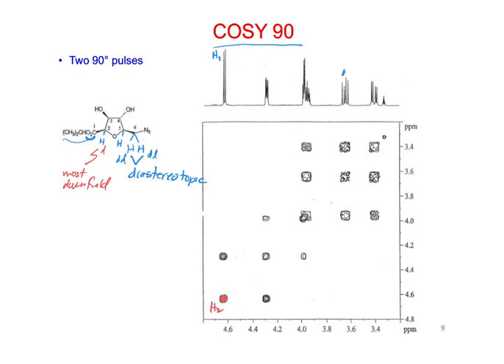Why are we not working with the points at 4.4 and 4.6, just above the H2? Up here? I mean here, just this one. Right, so we're going to start on the diagonal. So here's the diagonal. And so those ones you were pointing at are off diagonal, right?